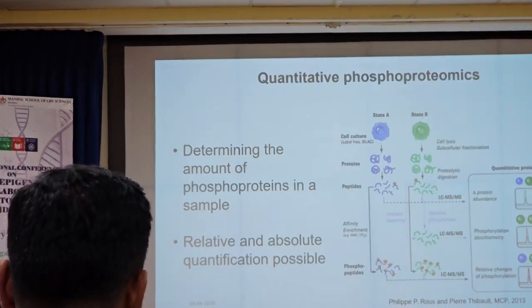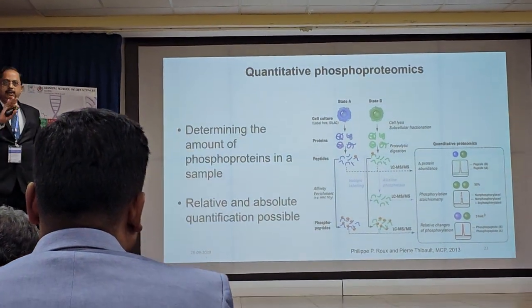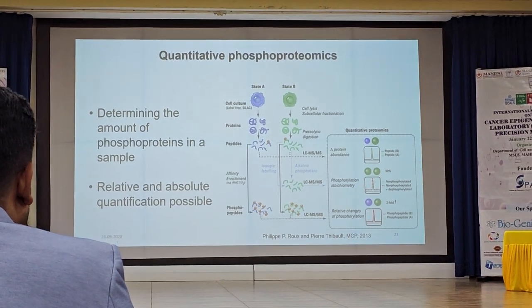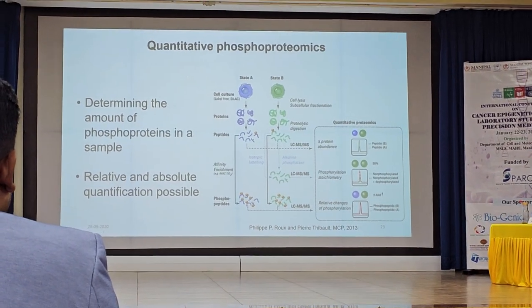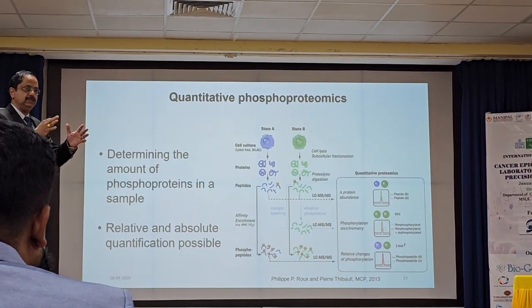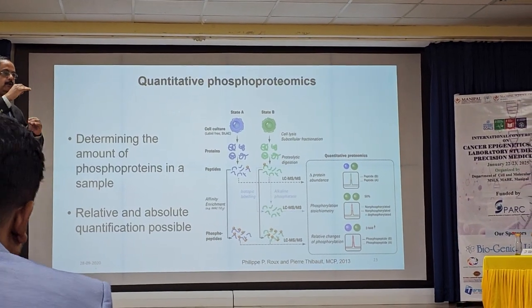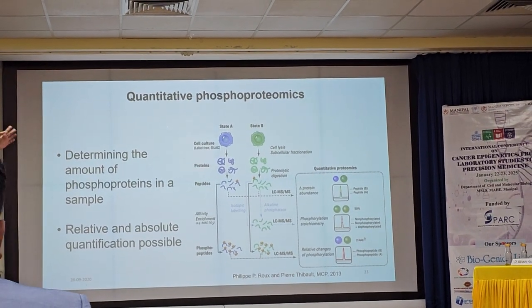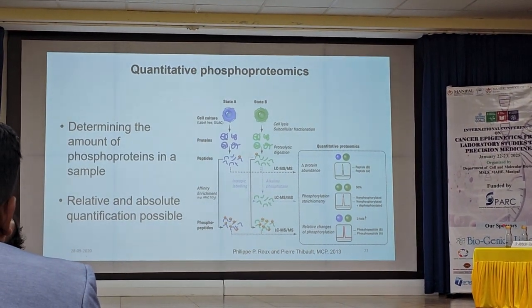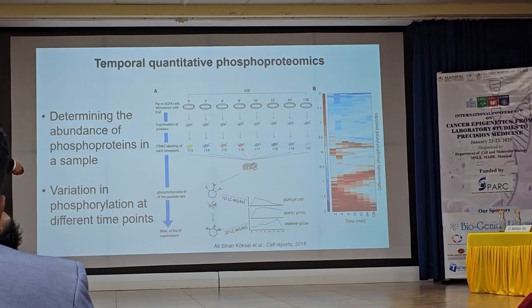Now you apply the phosphoproteomics method, quantitative phosphoproteomics, and then you can differentiate, not the expression which is happening in transcriptomics methods or Western blot or other methods. You are identifying proteins which are different, not in expression, but only in phosphorylation differences. So you can identify phosphorylations which are changing, not the protein expression which is changing, which is more functional because it gives activity to the protein.